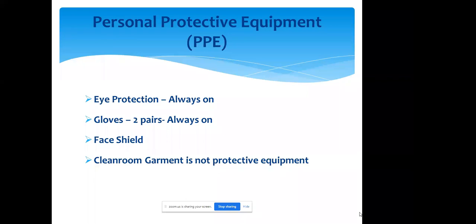Do not put on any heavy perfumes. I would say do not put on deodorant, but I take a stand somewhere. Hairsprays and all that stuff, the lotions that we put on our bodies, all those things emit gases that are detrimental to your process in the clean room.